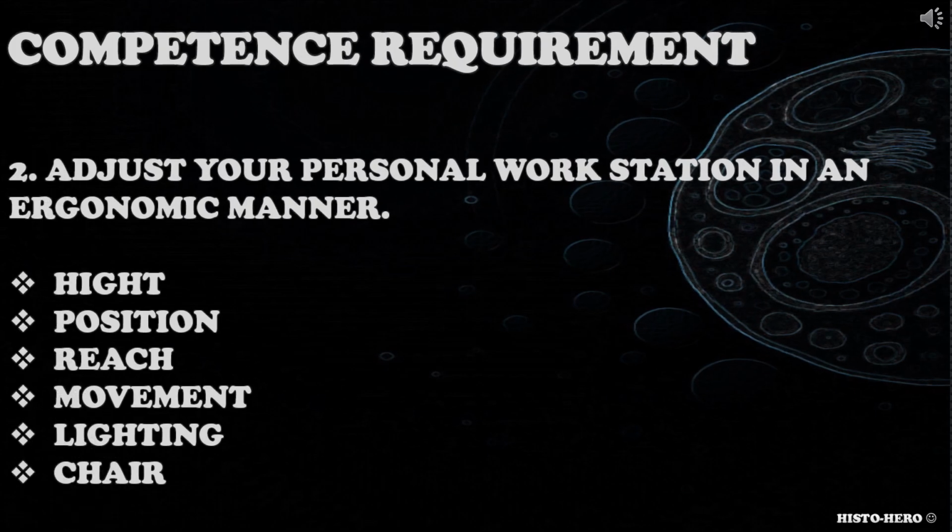The second competence requirement is adjust your personal workstation in an ergonomic manner. Candidates should be able to adjust their workstation in an ergonomic manner. Does the candidate know how to set up their workstation in an ergonomic way? Do they know how to adjust the bench, chair, lighting, and position of relevant equipment? Does the candidate know how to move their body so they do not sustain injury?